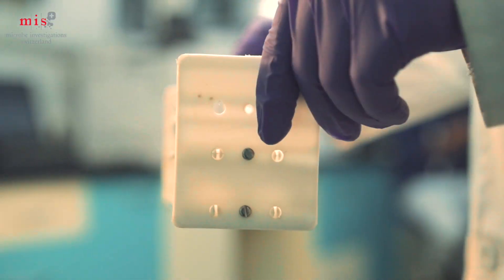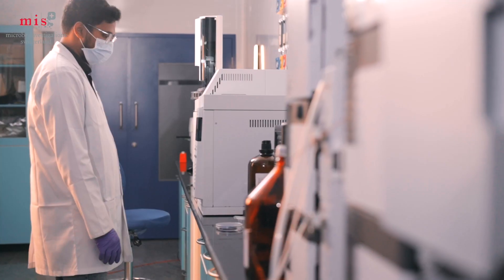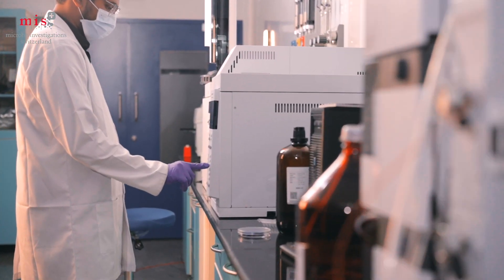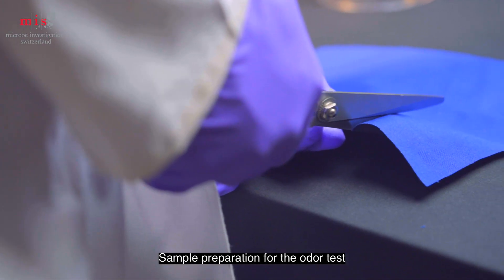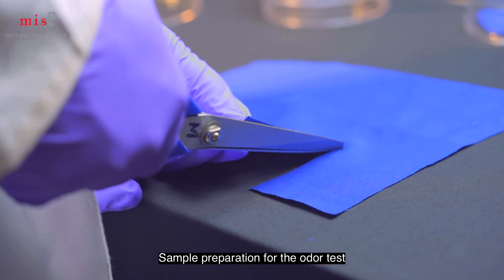ISA 17299-3 is a gas chromatography-based method to measure odor chemicals in deodorant testing of all textile products. This test can be performed by Method A and B. Both test methods start with cutting the test fabric to the recommended size or weight.